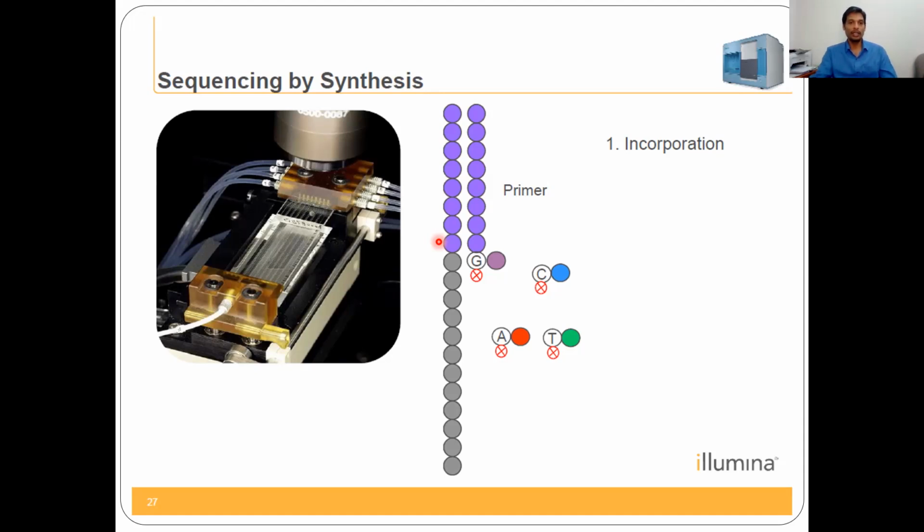But in Illumina sequencing, it is not like that. In order to understand comparatively, just to explain: here you are adding 4 nucleotides to the flow cell at a time, injecting them together. So this is how it looks. Here the flow cell is attached. You are going to inject those nucleotides, I mean, sorry, the ingredients.